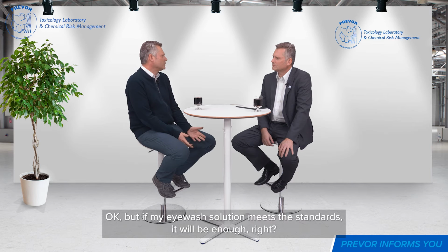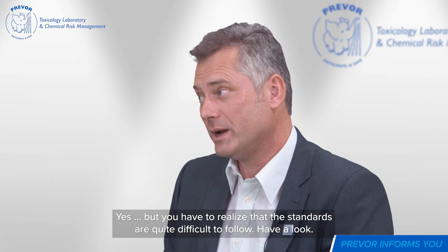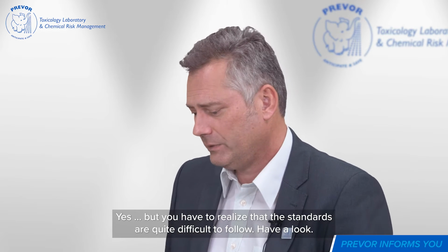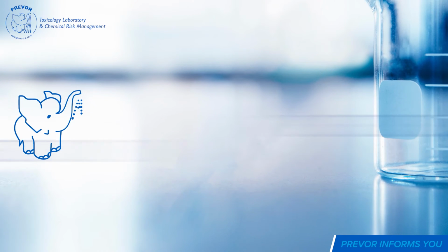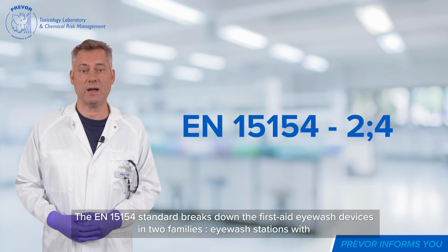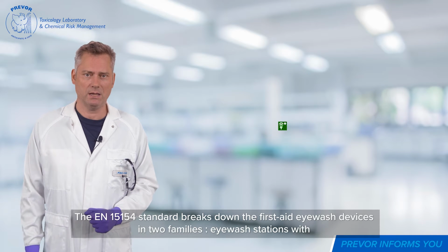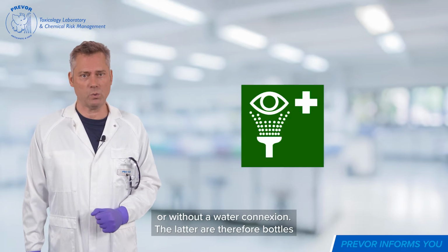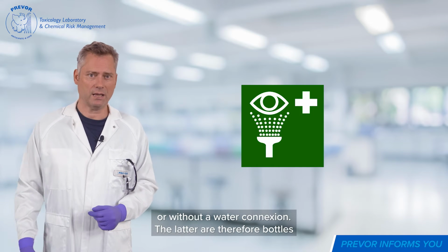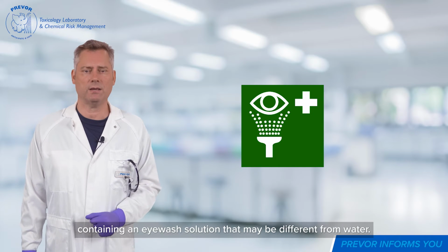Okay, but if my eye wash solution meets the standards, it'll be enough, right? Yes, but you have to realize that the standards are quite difficult to follow. Have a look. The EN 15154 standard breaks down the first aid eye wash devices into 2 families: eye wash stations with or without a water connection. The latter are therefore bottles containing an eye wash solution that may be different from water.